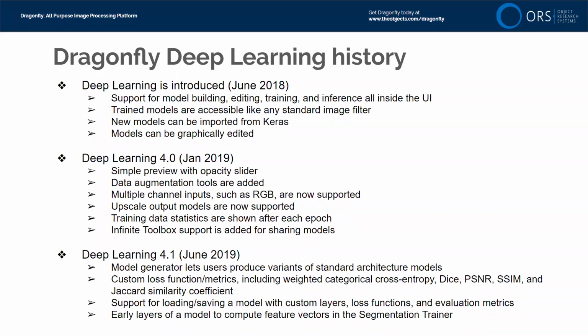I expect 99% of my users to never build or edit neural network models from scratch. It's quite an arcane technique. I don't even know how to do it myself. There's a lot in the literature. There's a lot of really bright people that are doing amazing work advancing the state-of-the-art in deep learning models. And then there are 100 times as many people that want to use those models. So if you're in the 99% like me, you don't have to build or edit your models in Dragonfly. You're able to take advantage of reusing existing models. But that is to say, you can do it in Dragonfly if you are one of the 1%.